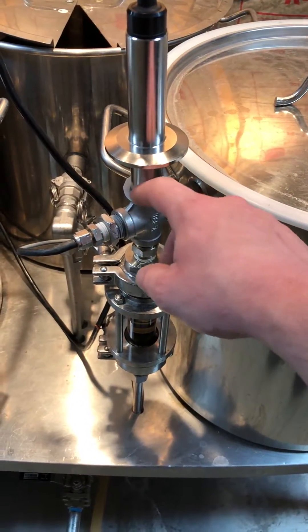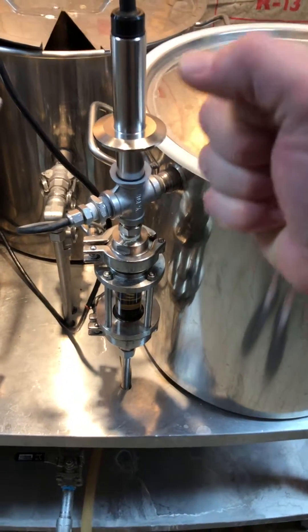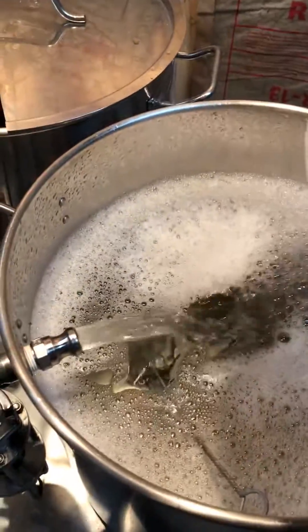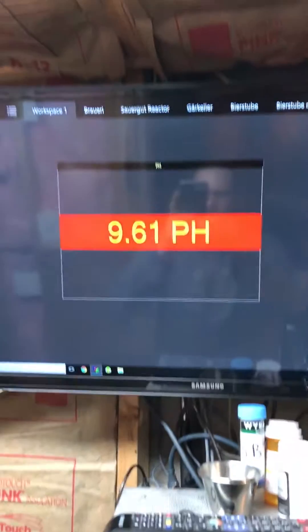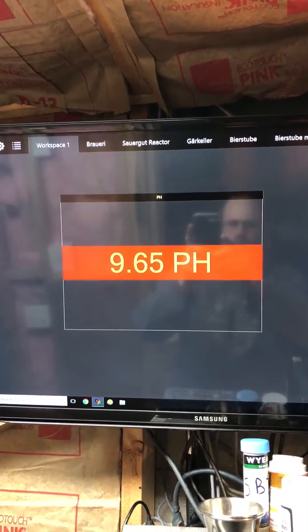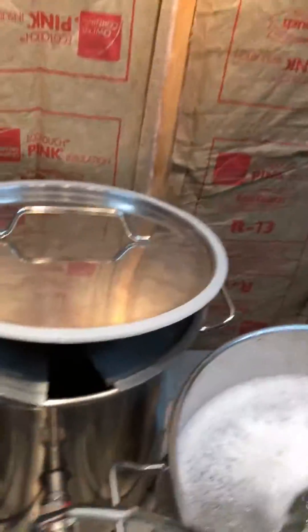There's a little gasket on the probe, and I took some silicone — I had a triclover glass gasket — and I trimmed it and stuck it in there. With that gasket and this gasket it makes a tight seal. I calibrated it and started it up, and here it is in my new software on the screen in real time and also on the actual box.